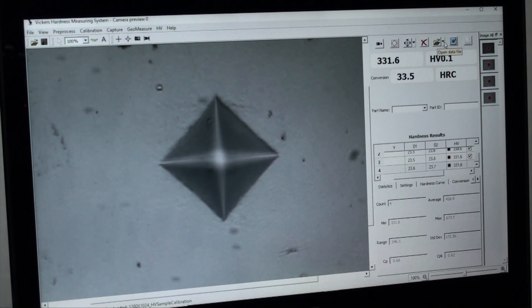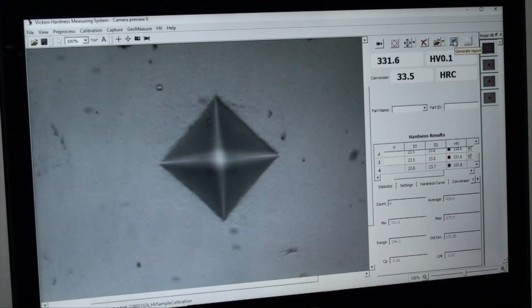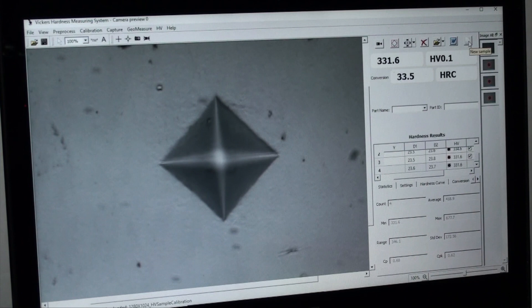Image library all the way to the right. We have conversions below and finally below that we have hardness results in a table.